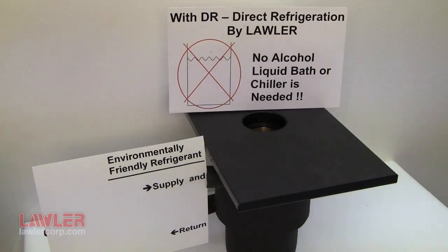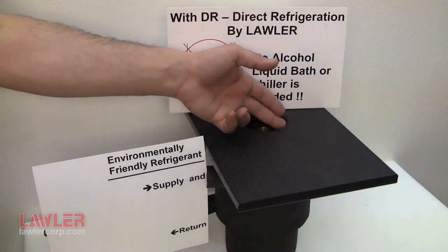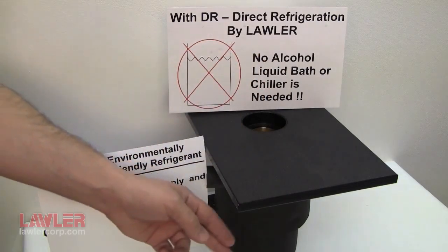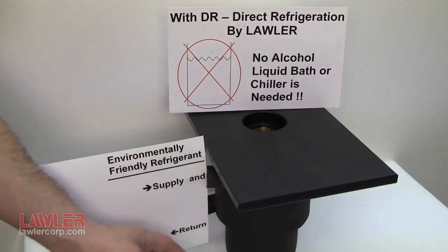Lawler was the first to market direct refrigeration back in the 1990s. Not seen below the top of the instrument and support rack is the metal test jacket. This cutaway shows the insulated jacket and plumbing connections for the refrigerant to flow to a compressor.